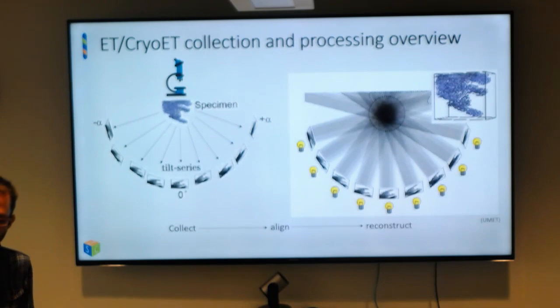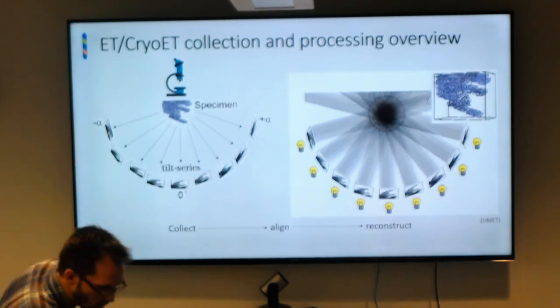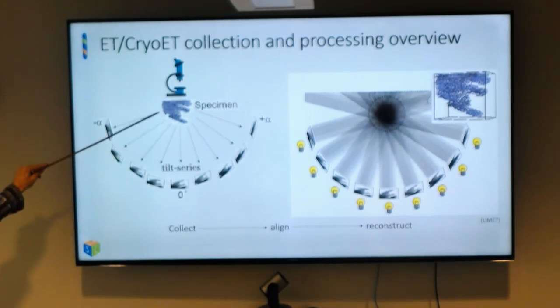And you tell your goniometer to tilt to a certain spot, but it's going to be off somewhere, angularly, and in X and Y, and in Z. There's going to be some error, so I'm representing those errors by little shifts in these images. And so what people often do is they throw 5 or 10 nanometer gold beads into their sample solution before they freeze their sample.